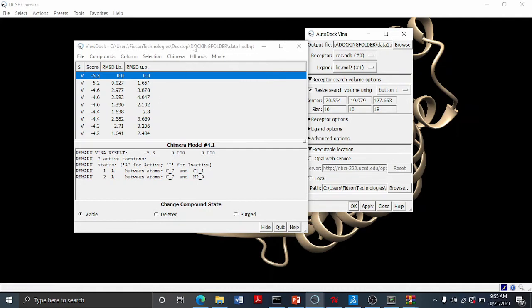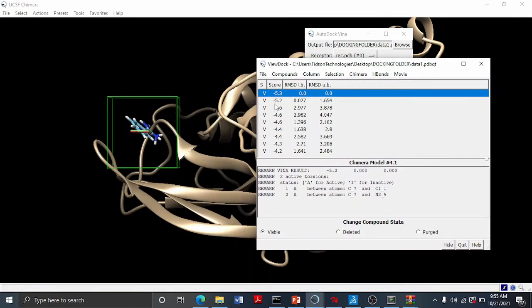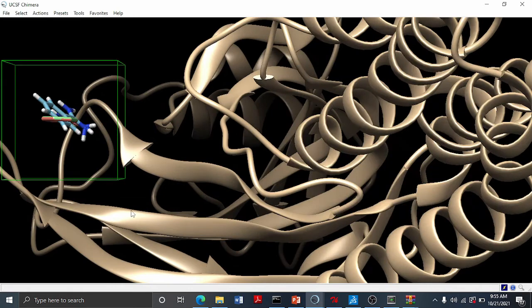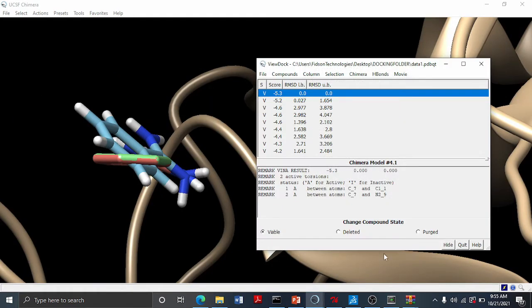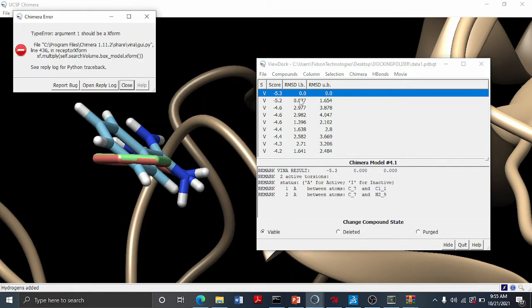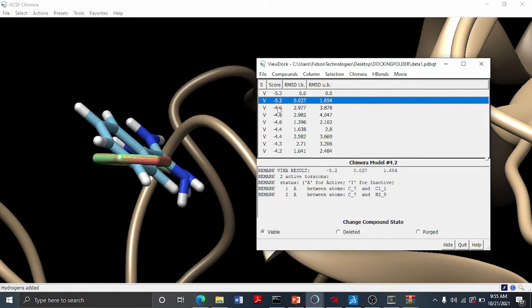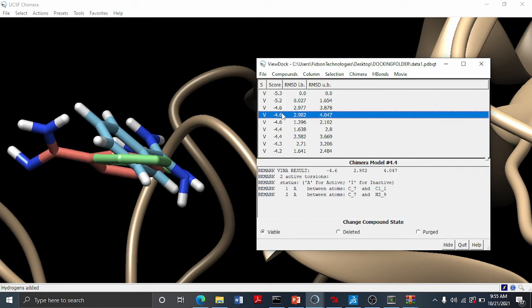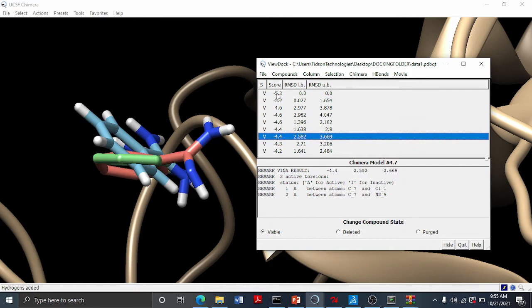As you can see, it has finished running and we can see our new molecule is there. Soon as the docking study is over, we can click OK, and then we can start checking the various poses, the various poses that the new ligand that we just docked in is giving us.